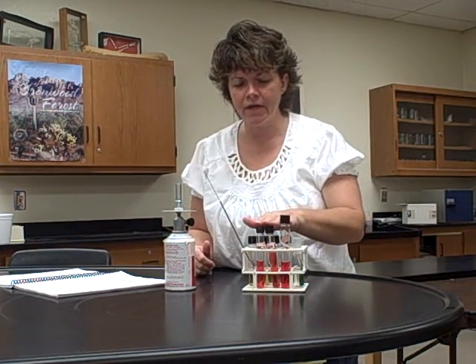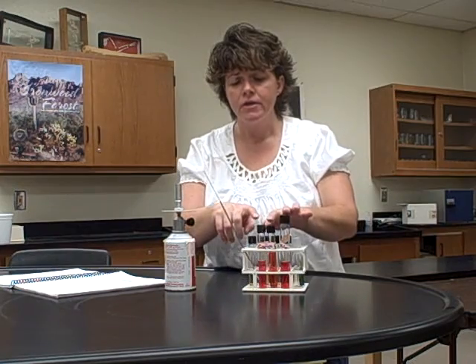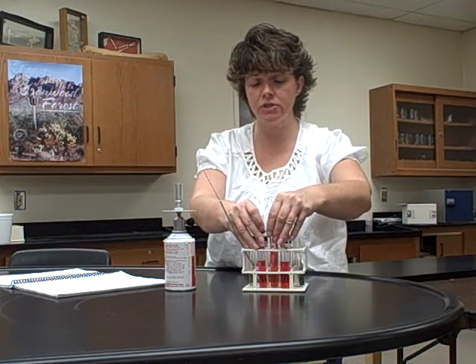If I give you 1 culture, you'll end up with 3 of these tubes. If I give you 2 cultures, you'll end up with 6. It'll probably be limited by however many tubes we have when we get our supplies. If I have enough to assign 2 per group, I'll do 2, but if we don't, we'll just do 1. Regardless, you're still going to do the same procedure. So pretend that I've assigned you E. coli. You'll need E. coli for the fermentation tubes.